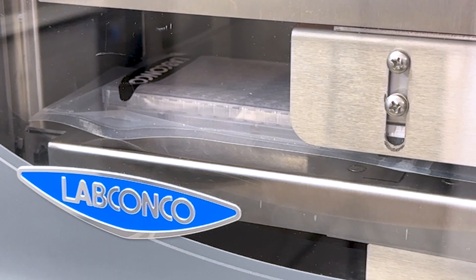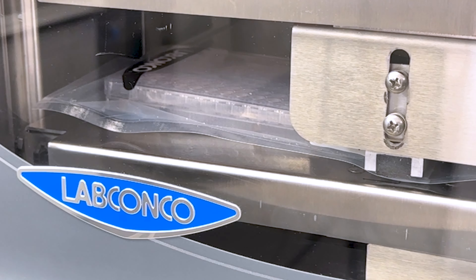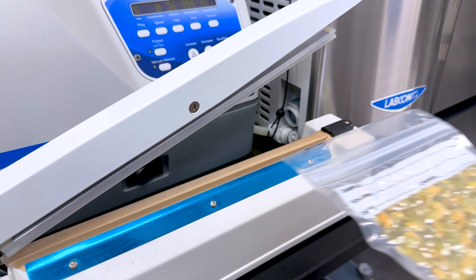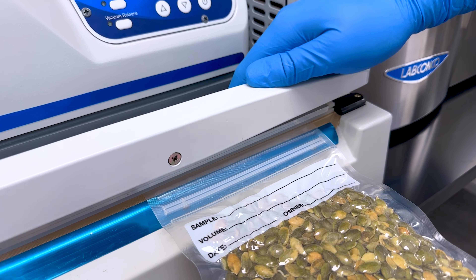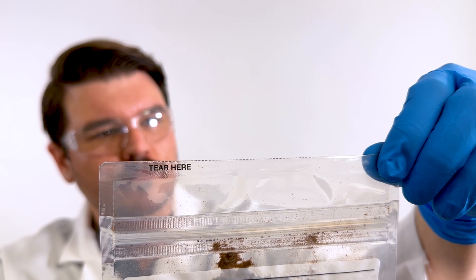Flexible zipper-sealed containers conform to the shape of samples, creating a vapor barrier that blocks humidity and extends sample shelf life. For added peace of mind, a commercially available Impulse Sealer can provide a secondary heat seal, further safeguarding samples from unwanted moisture.